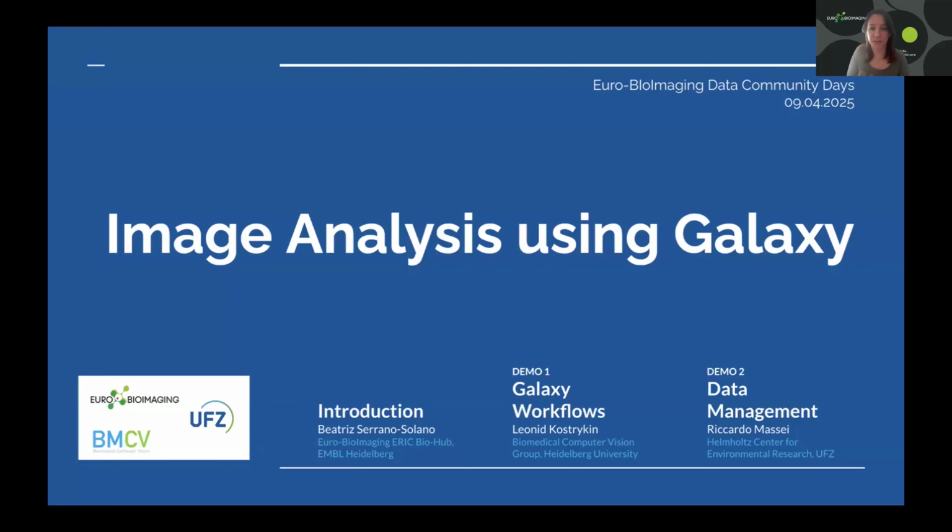This is about image analysis using Galaxy. My name is Beatriz Serrano-Solano. I work at the Euro-BioImaging BioHub at EMBL in Heidelberg.